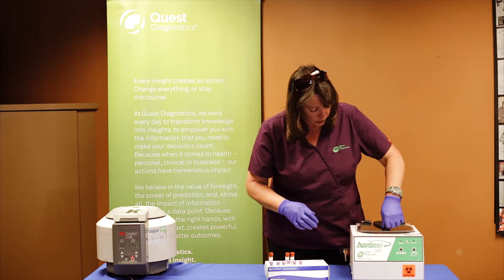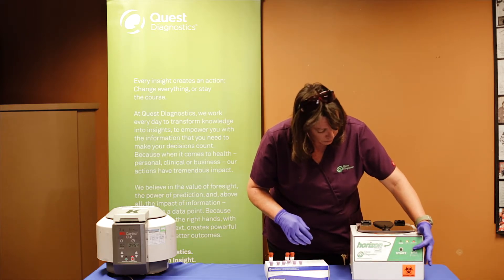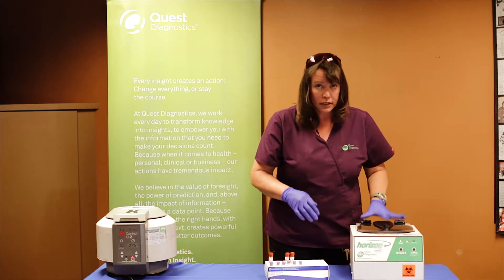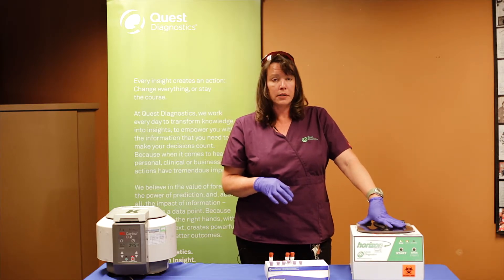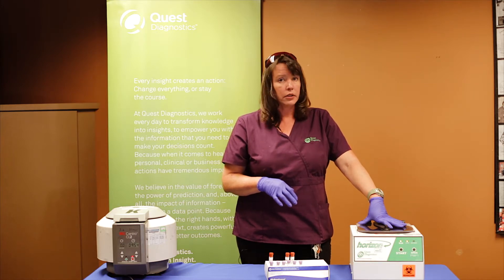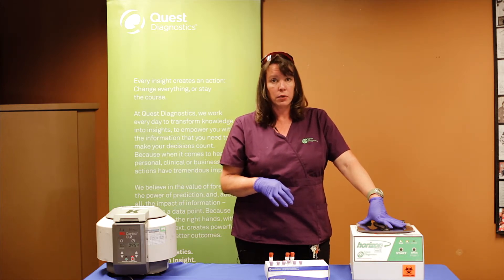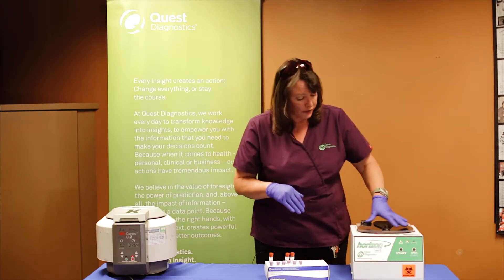What you do is load your machine and turn it on. This machine is automatically set to the correct RPMs by the manufacturer and the time is also set. So the only thing you have to do with this machine is load it, turn it on, and it will automatically shut off at the correct time.